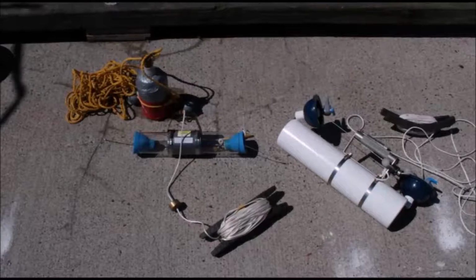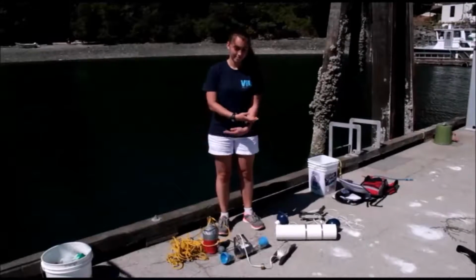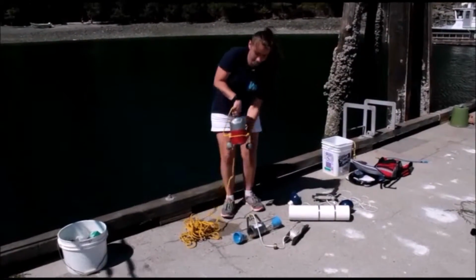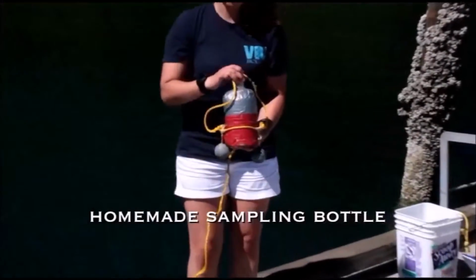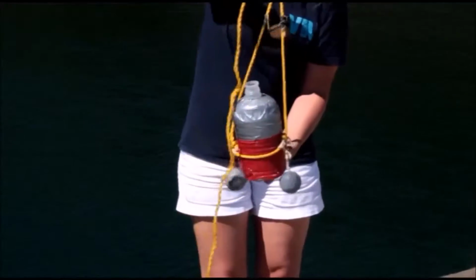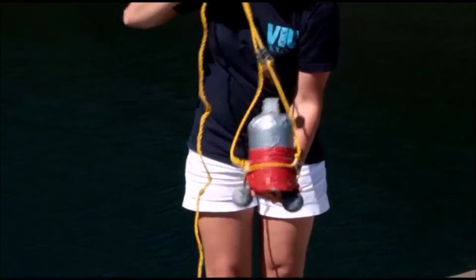Now a word about different plankton samplers. There's various different designs of plankton sampling bottles. They all differ in cost, efficiency, and ease of use. We use a homemade sampling bottle. It's cheap to make and easy to use. It's deployed closed, corked, and then at the sampling depth, a tug on the rope pulls the cork out of the bottle and the sample fills up.